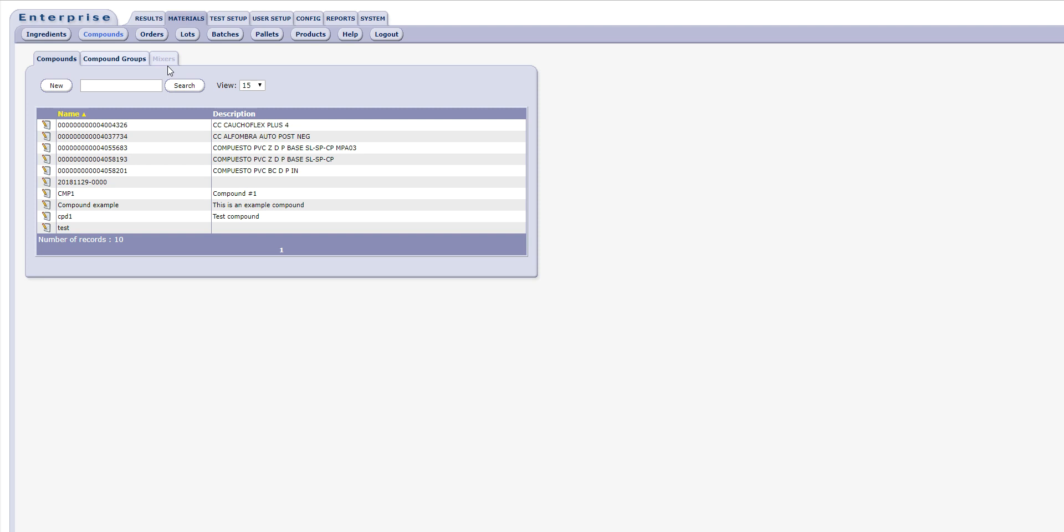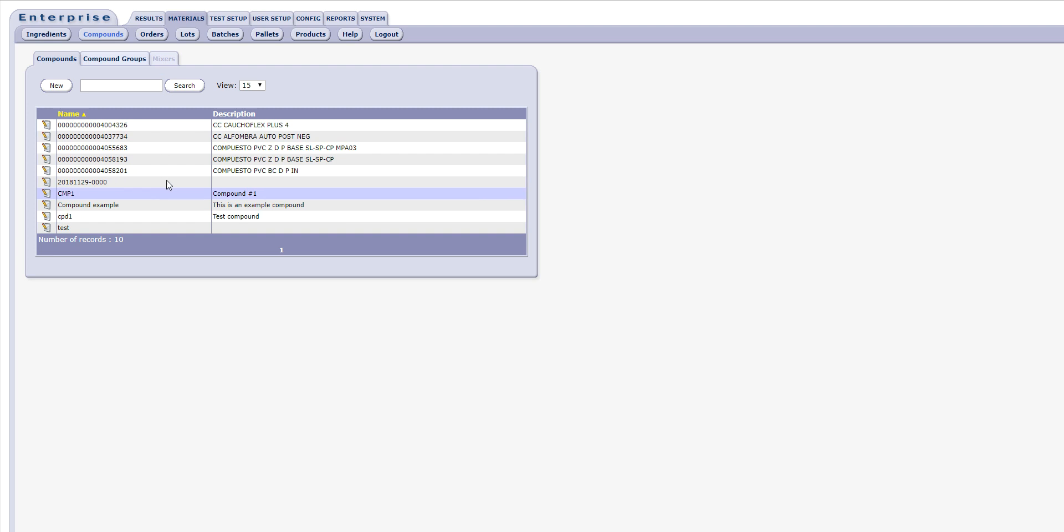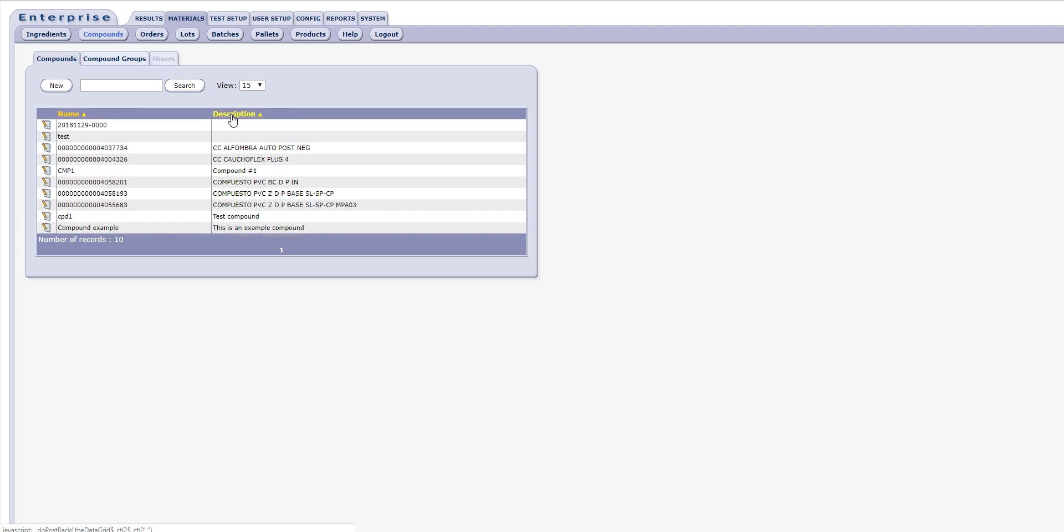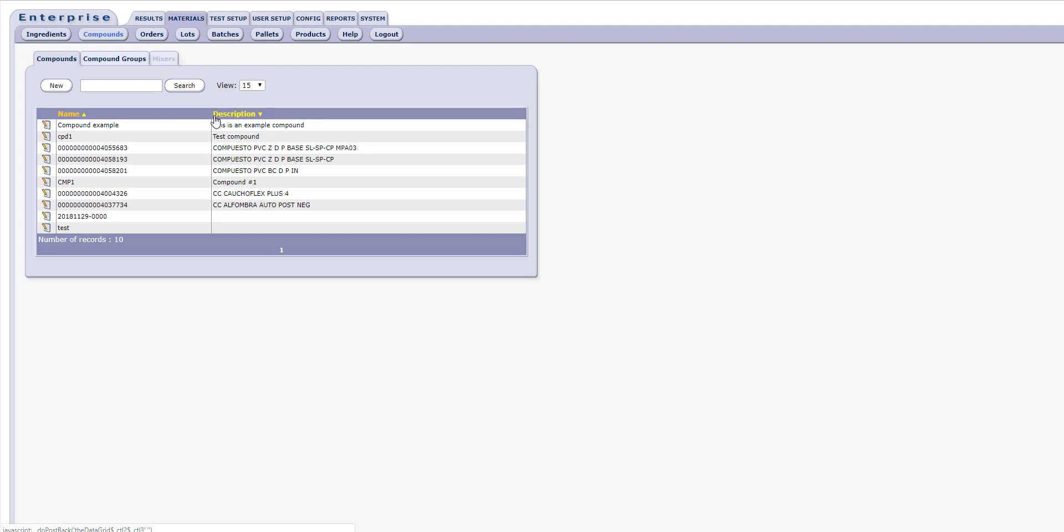By default, the screen displays a list of compound records sorted by the compound's name, but also sortable by clicking on the header of any of the displayed columns. There is also a search box available to narrow down the list of compounds.